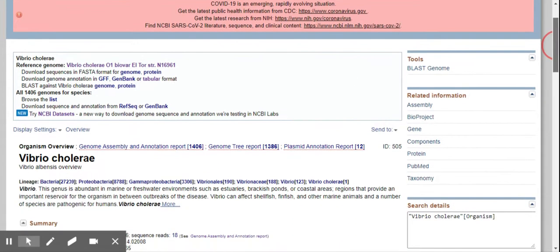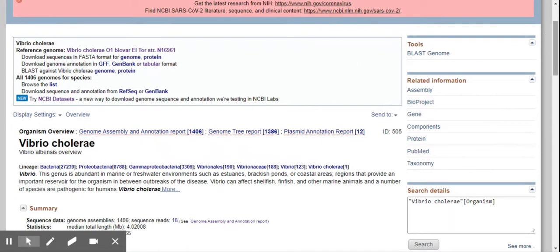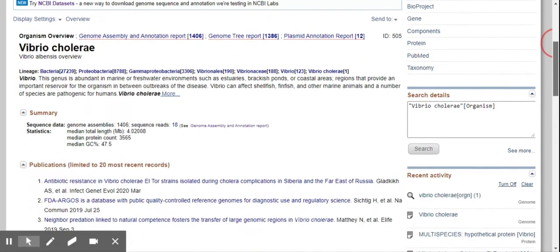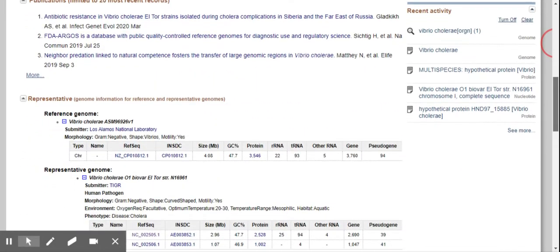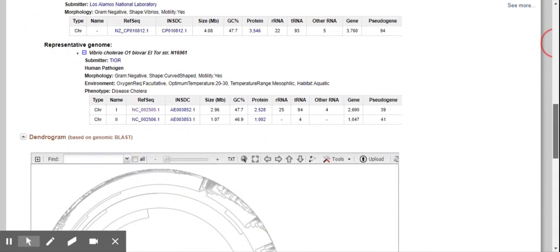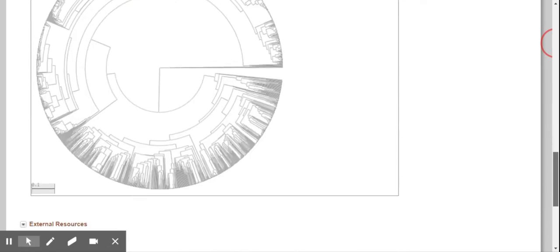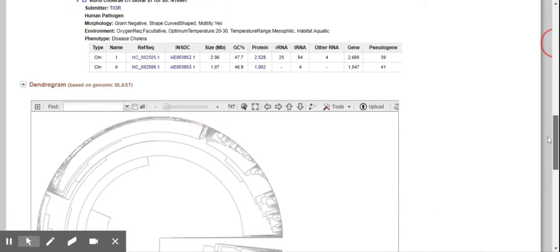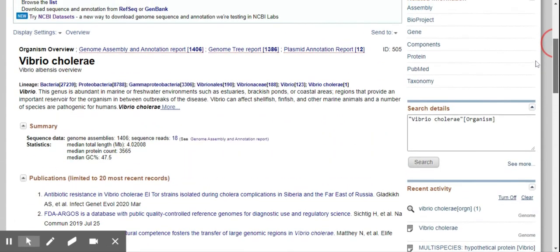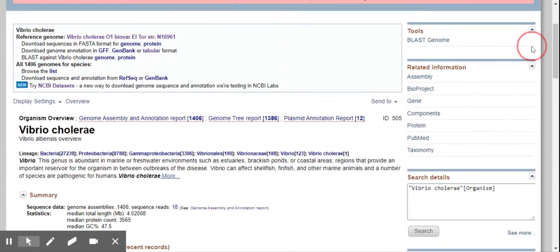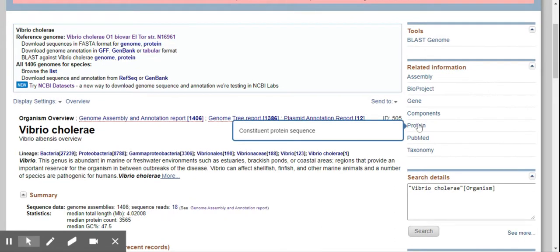So first thing first, we want to see what do we want to see. We want to see the hypothetical protein, right? So you can go to protein there.